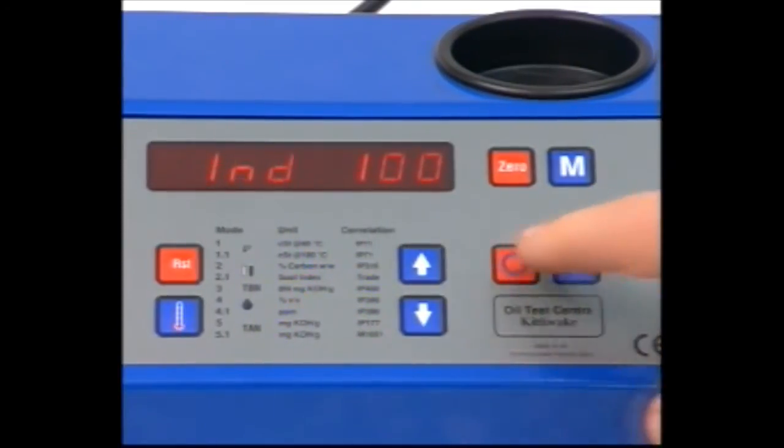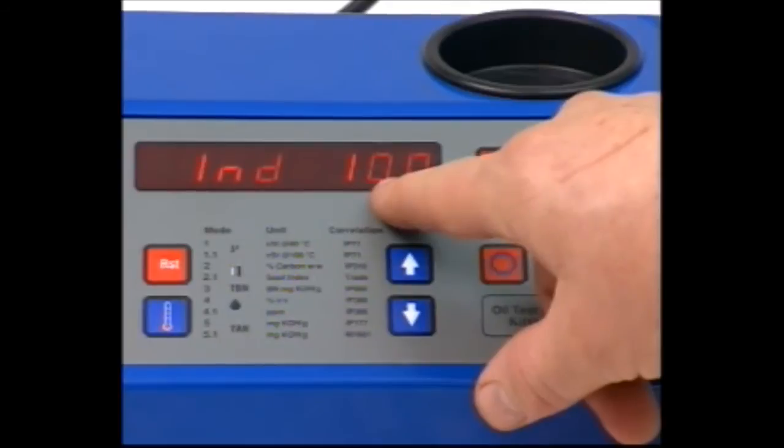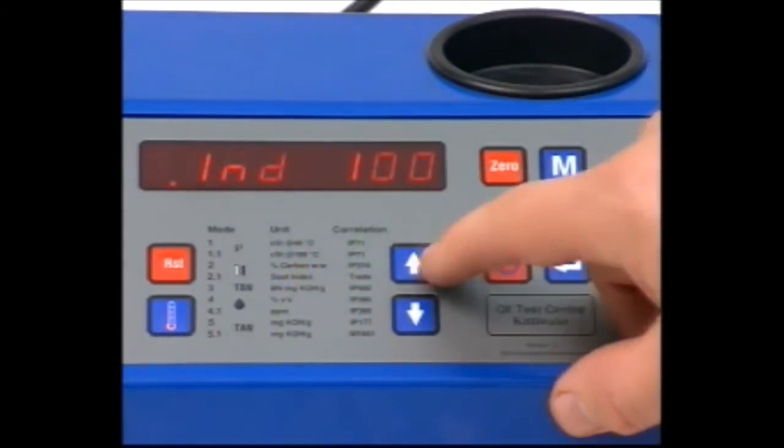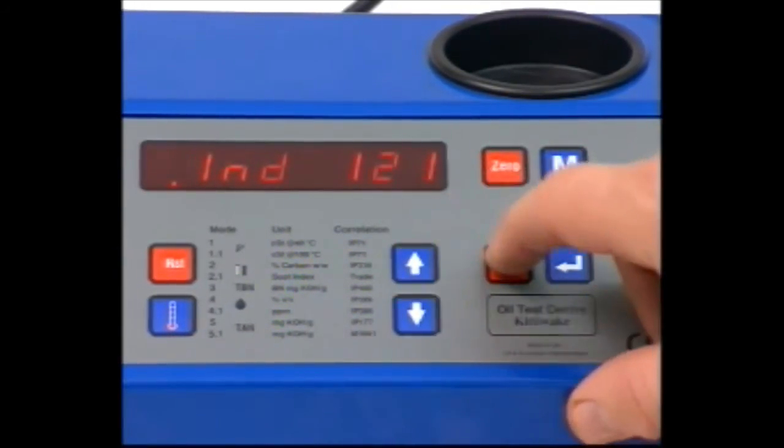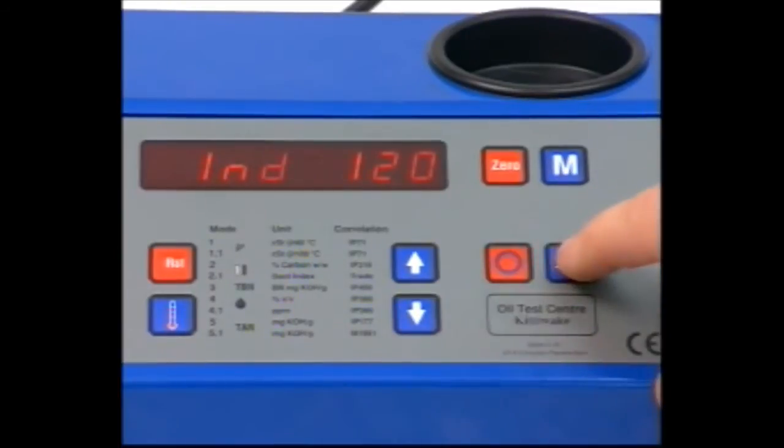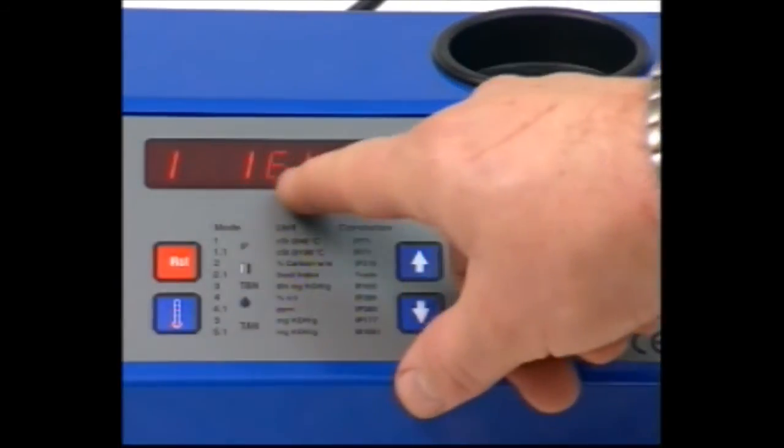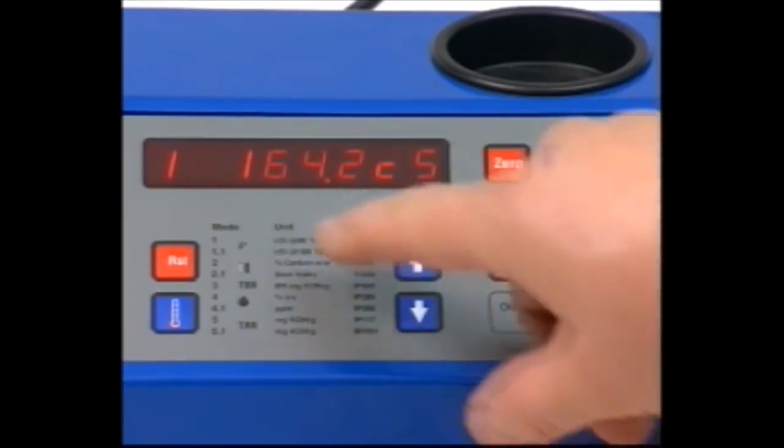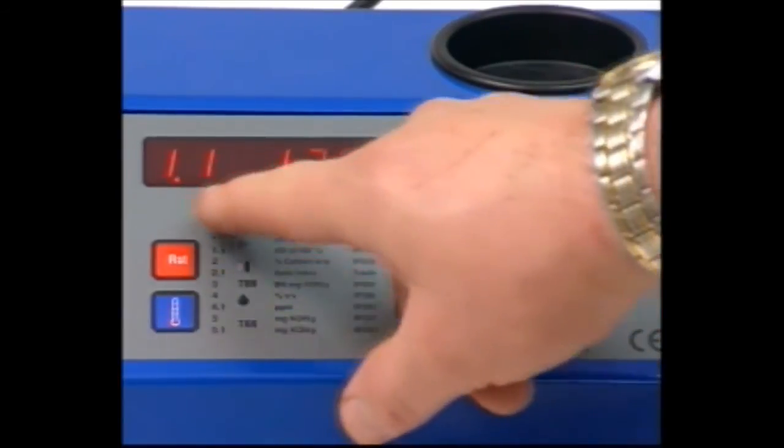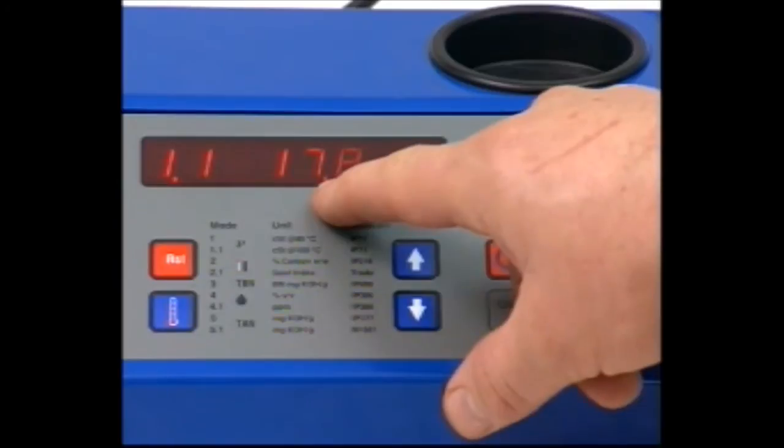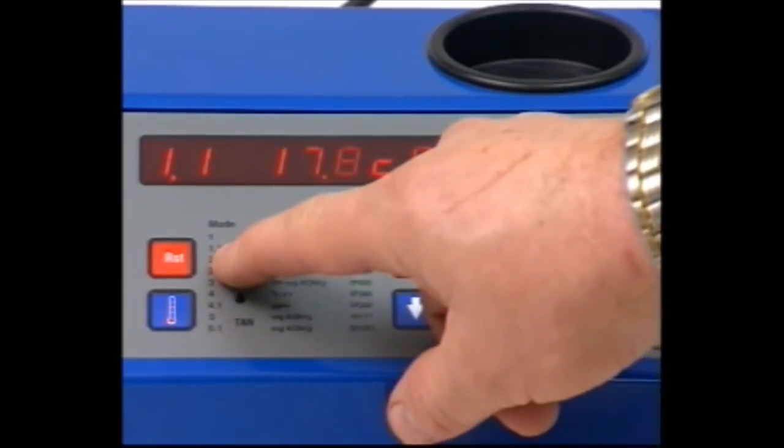Press Return again to change the viscosity index and enter the new value. The default here is 100. Press Return once more and the viscosity reading is corrected using the new values entered for density and viscosity index. Further readings will use these values until the Mode button is cycled or the Reset button is pressed.